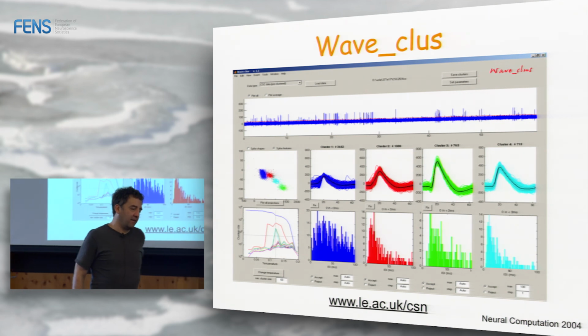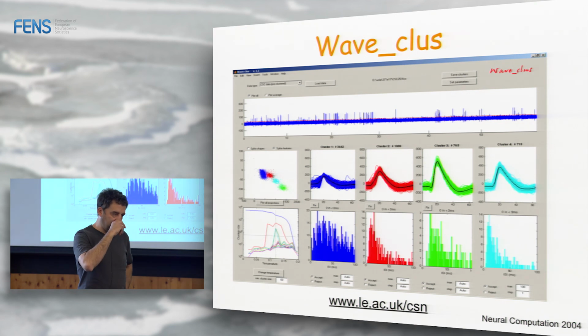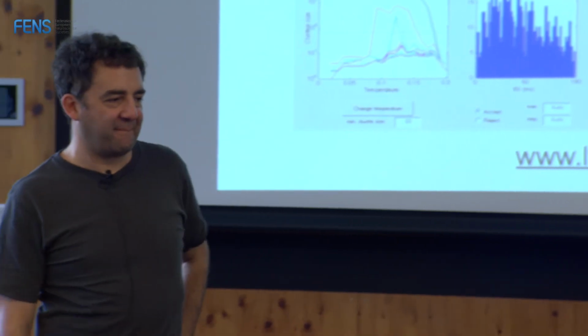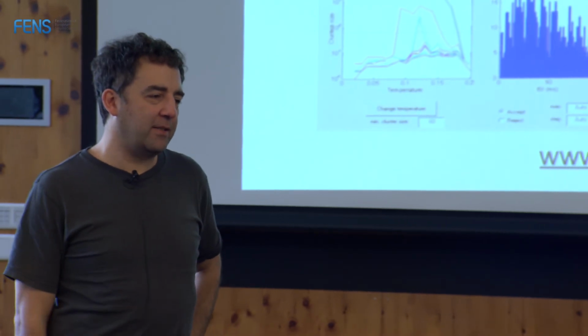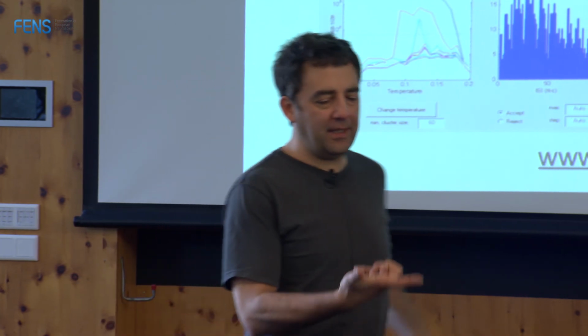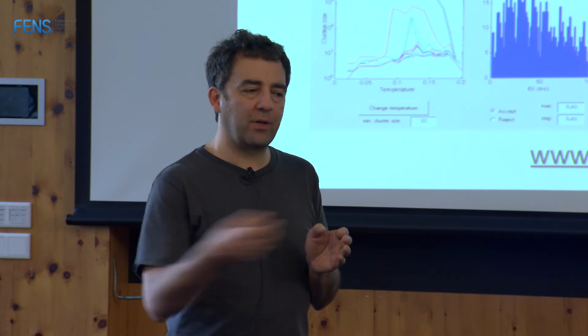I have a question. When we are recording from one site over several sessions or several days, how can I be sure that what I'm seeing each day is the same neuron which fired? You want the quick answer? Never. The only way to do that, which is what we're trying to do now and what some people are doing, is to record continuously.